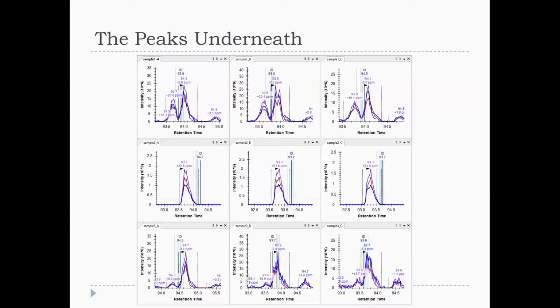Well, what do you see up in this top row? So you can see this peak that we're picking. We get an ID in it most of the time. Actually, in all 3 runs, we get an ID. We're actually getting IDs down here. We get IDs in every run, right? But what do we see up here? Yeah, there's an interference. There are 2 peaks here. And so this is what I call, and actually you can see that it's 20 ppm. Ooh, the plot thickens.